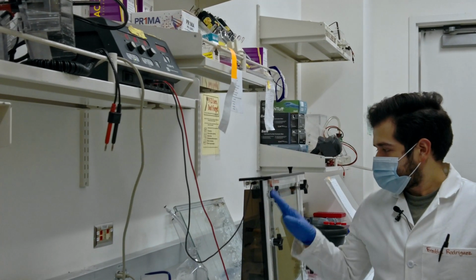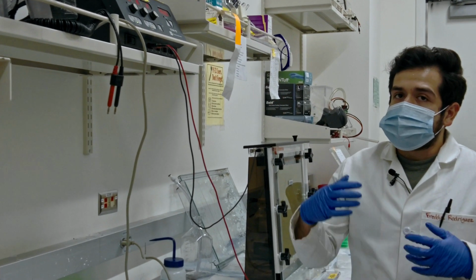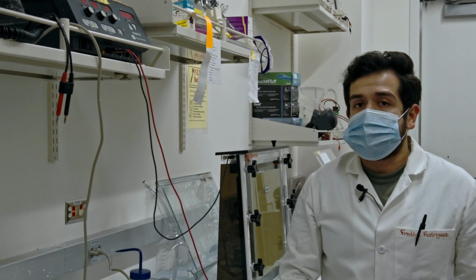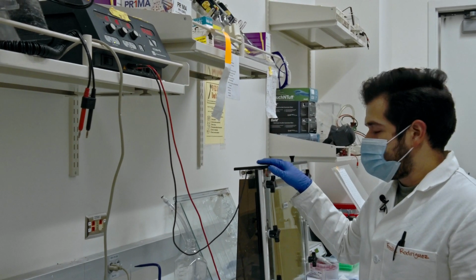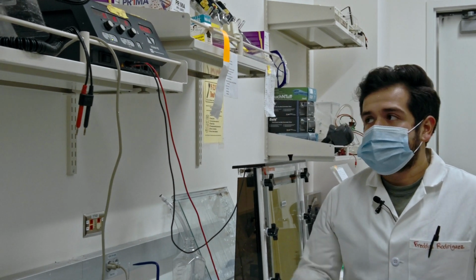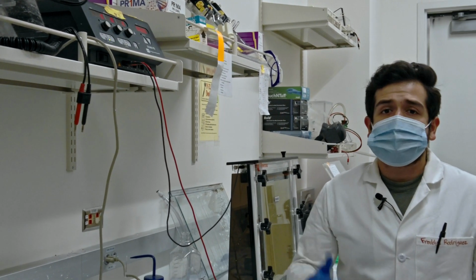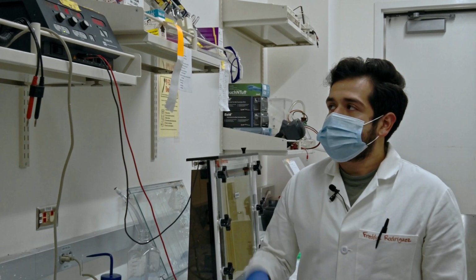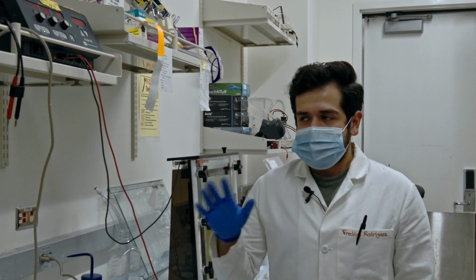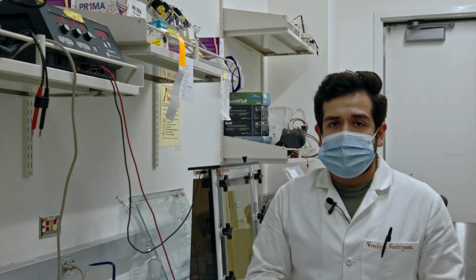Now that we've plugged in our gel box into the power generator, what we need to do is set up how many volts to run as well as the time. Usually automatically what you see here on the power generator is that it runs for about 5 hours. This is because we run our gel for about 30 minutes to an hour to preheat it. During this time, we're usually running one of our assays. Then after we're done, we turn off the generator for a split second just to add our samples. And then it runs for an additional 3 to 4 hours depending on what kind of voltage you're running across the plate. So typically for this gel box, we run about 1600 to 1800 volts max. So samples will be run through the gel in about 2.5 to 3 hours. They'll separate nicely in order for us to get phosphor imaging done.